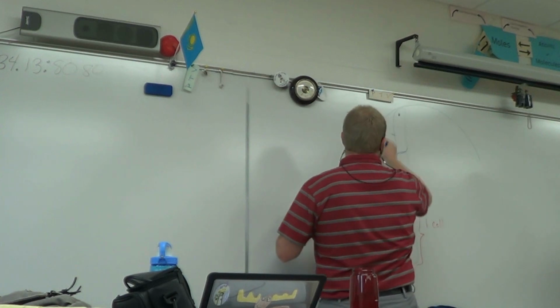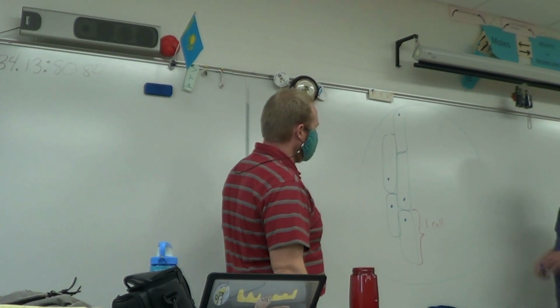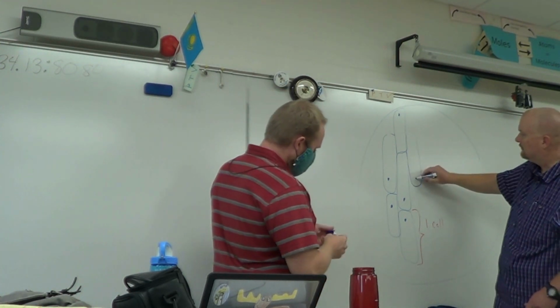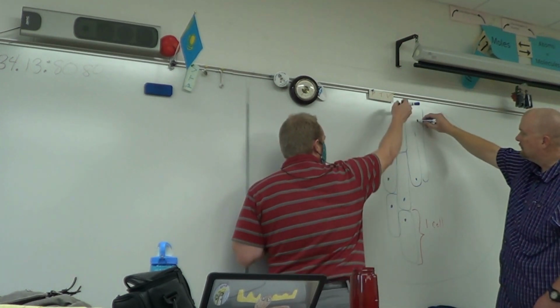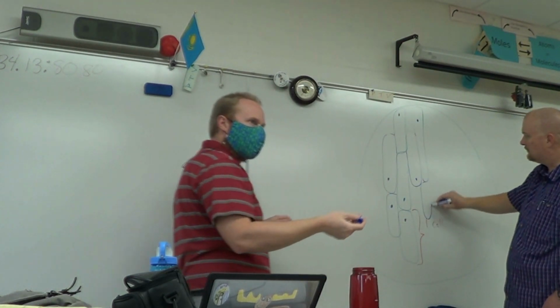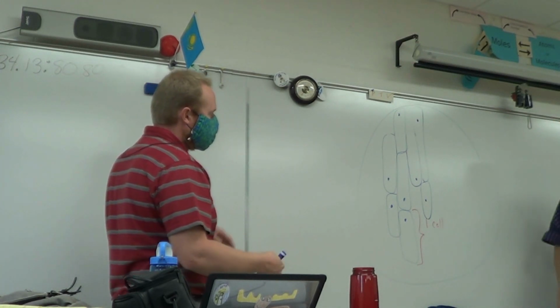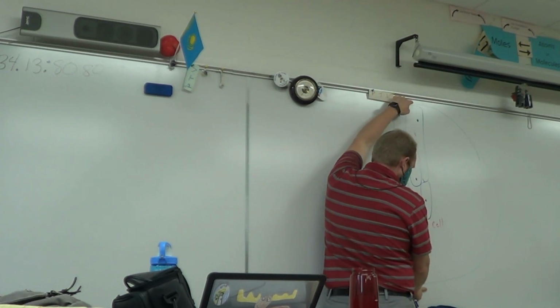So again, if this is our field of view, that was not a very good circle. But the idea is, again, estimating size, if from here to here, depending on whether we're on high or low power, is some known field of view. So if, let's say this is high power, from here to here is 0.45 millimeters.